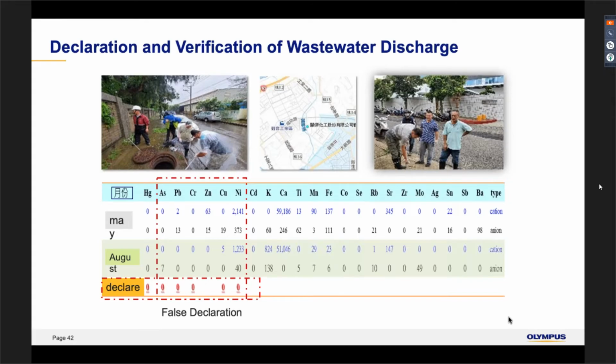And the XRF measurement is quick. So in any in situ status, I think everyone in a specific area will find something abnormal, so they can put the tiers.